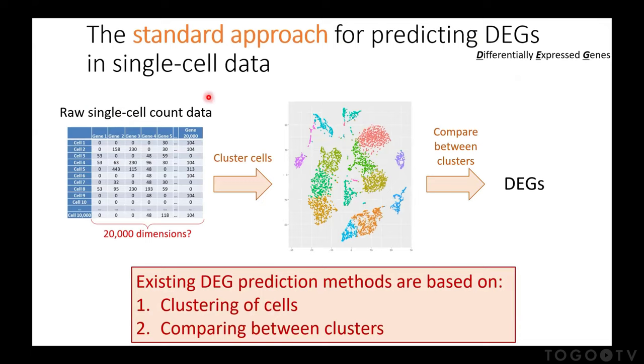Maybe you know we can isolate single cells, many single cells. And after several steps, we can count how many transcripts, how many mRNA molecules, we find in each cell. After some processing, it basically looks like this kind of data. For every cell, we have a row, and for every gene, there's a column. Those numbers are the counts, how many RNAs we find for each gene in each cell.